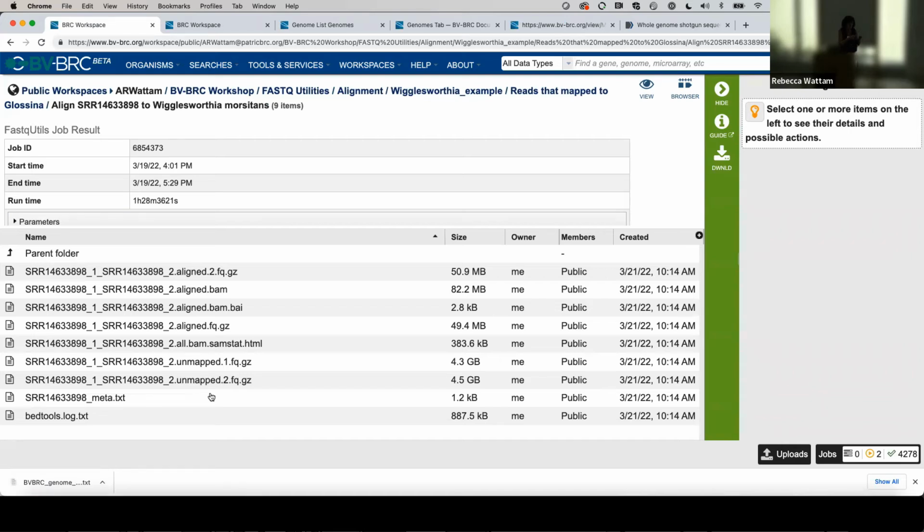But we have another service we're going to talk to you about today called metagenomic binning, where you can just submit it to that and it's going to take them all out. And if it can pull up a complete genome for you, it will do it. So that's later today. Does that answer your question? Great, thank you. Okay. Yes, question.